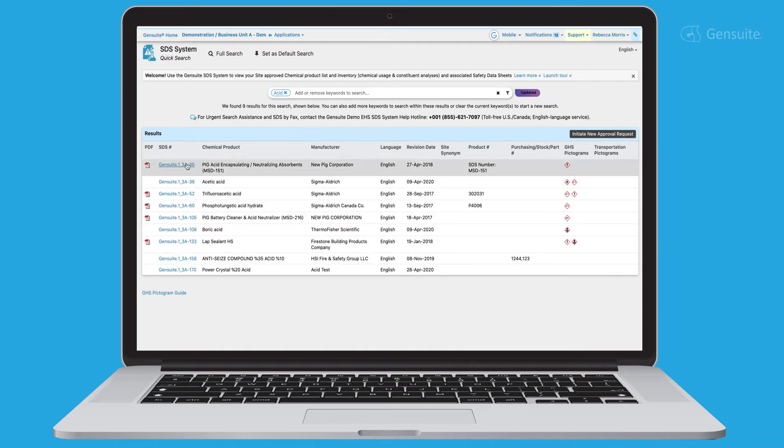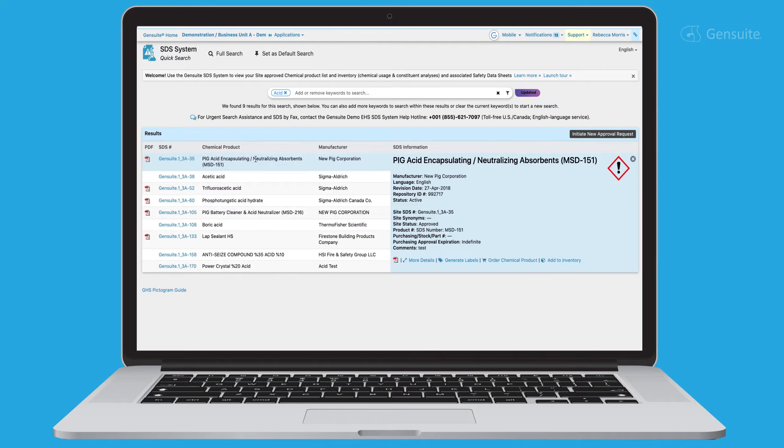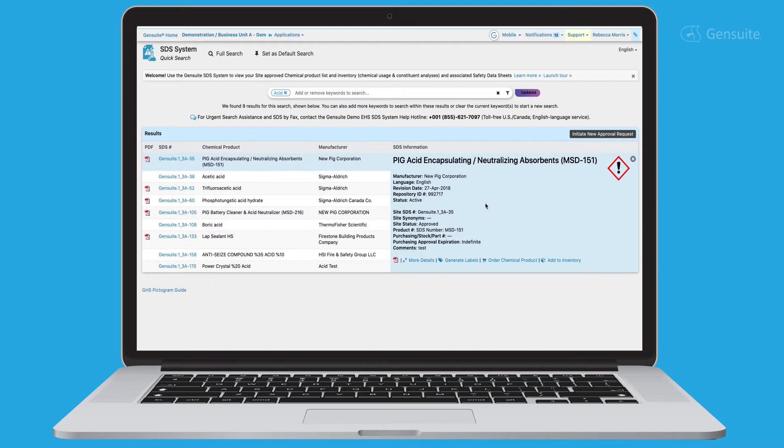A summary of the SDS appears to view at a glance. Chemical product description, manufacturer information, revision date, product number, GHS pictograms.